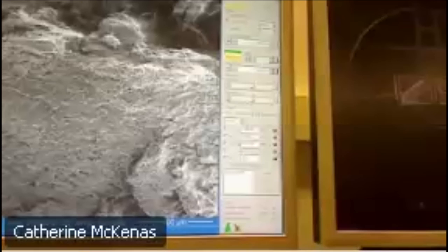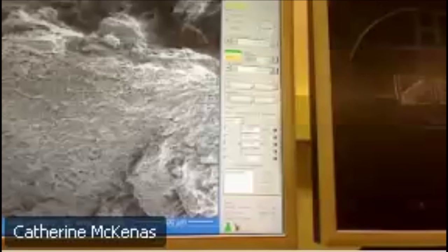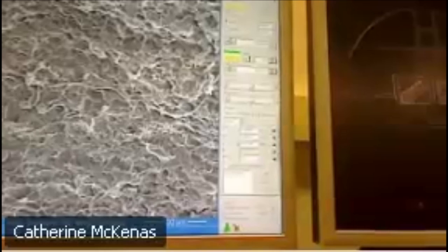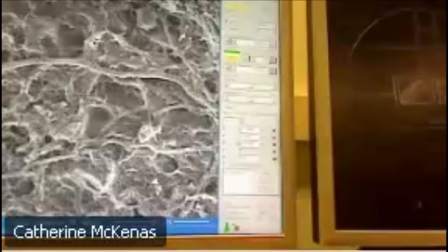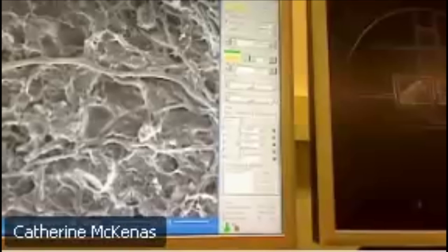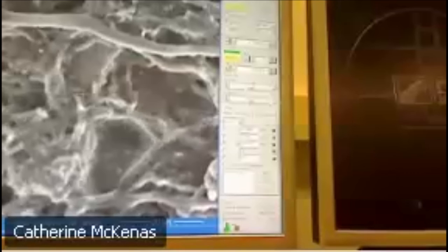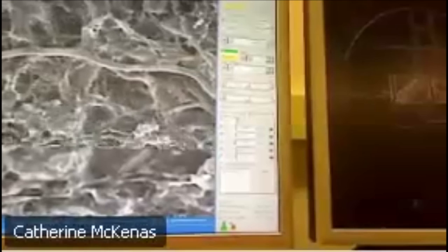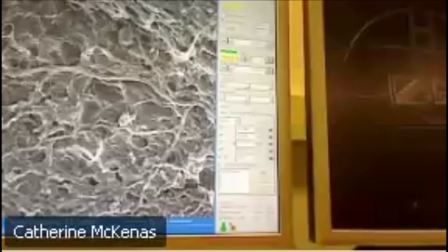Okay, so do y'all see the structure of that top layer, or is it blocky? Let me slow down. Pretty decent right now. If we zoom in here, you'll start to see that the material gets pretty porous, like there's some openings in the material. That is to allow for the flow of nutrients and air at the top of this lichen. And then it's very interwoven, very intricate material right here. These features, you definitely can't see them with the human eye. They're probably around 10 or so microns in width. So it's pretty porous material, again, to allow for that nutrient flow. I think we're going to take a picture of this top, and then we're going to move to the second layer area.